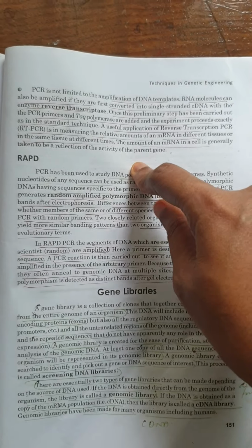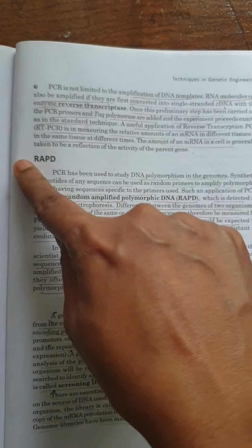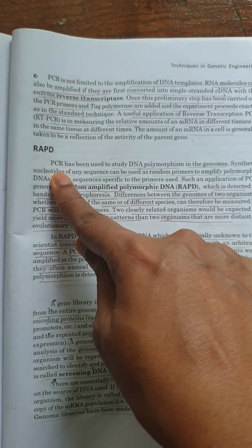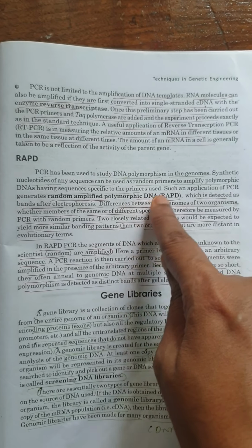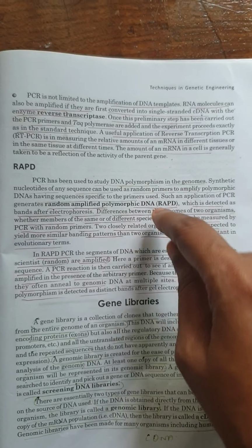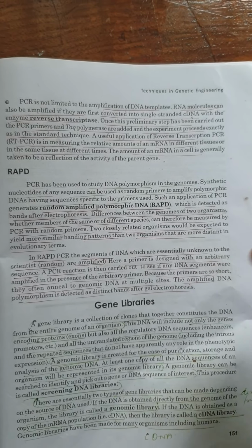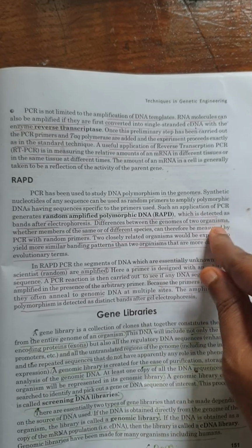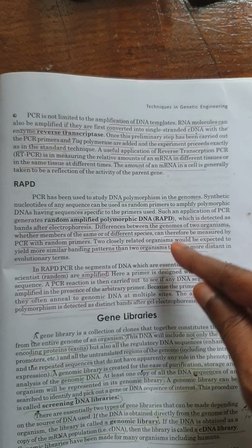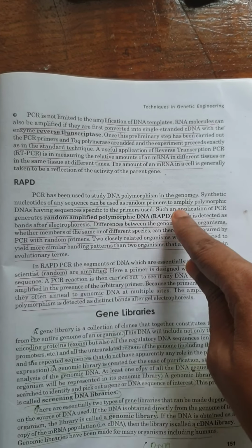So we were discussing the applications of PCR. Next is RAPD, random amplified polymorphic DNA. PCR can be used to study DNA polymorphism. For that we are using a primer that is random. We are using a random primer for random amplified polymorphic DNA.